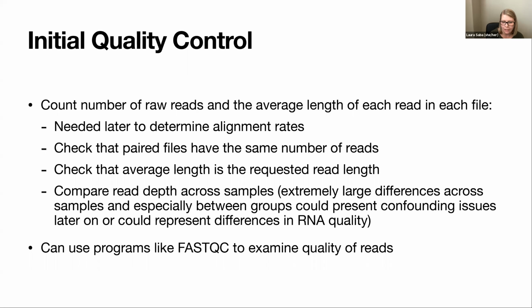And then finally, there are programs out there like FastQC that will look more in depth into the quality of these raw reads, looking at things like the drop off of the quality as the read gets longer.